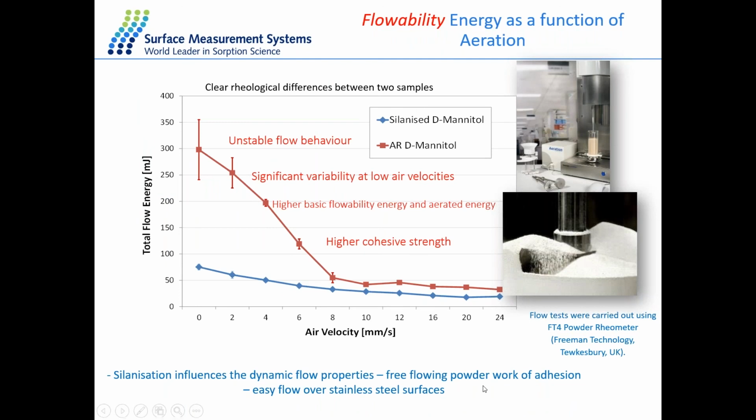What we can also do with this is correlate to other properties such as flowability. Due to the high surface energy of the as received D-mannitol, we can correlate this to higher cohesive energy and cohesive forces. So we've done an experiment where we've introduced some air velocity to the sample and calculated the total flow energy.